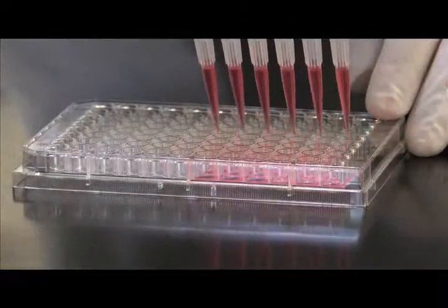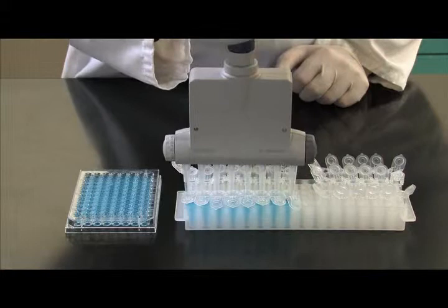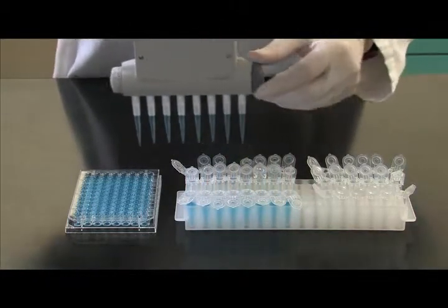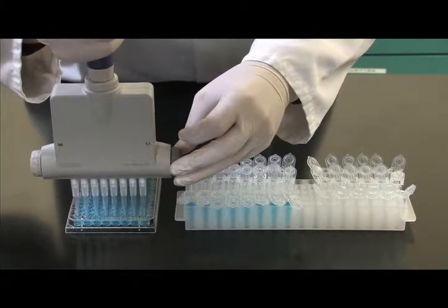The adjustable spacer is also available as an electronic pipette. Precision, accuracy and ergonomic design. Raynin's family of adjustable spacers will simplify and streamline your application workflow.